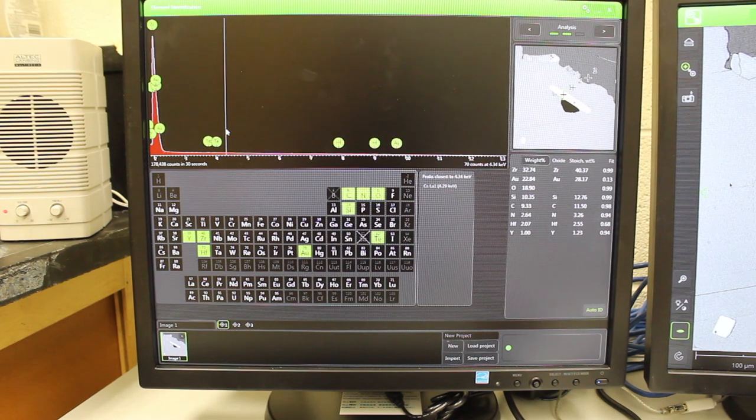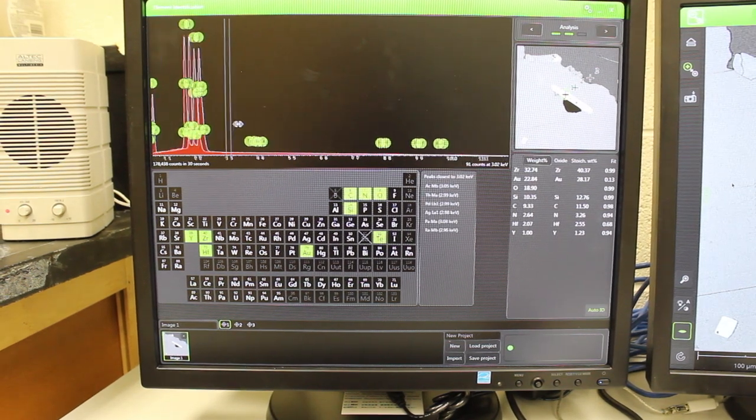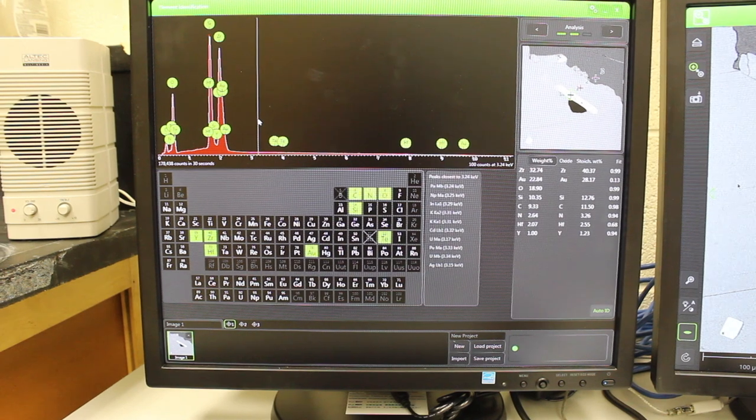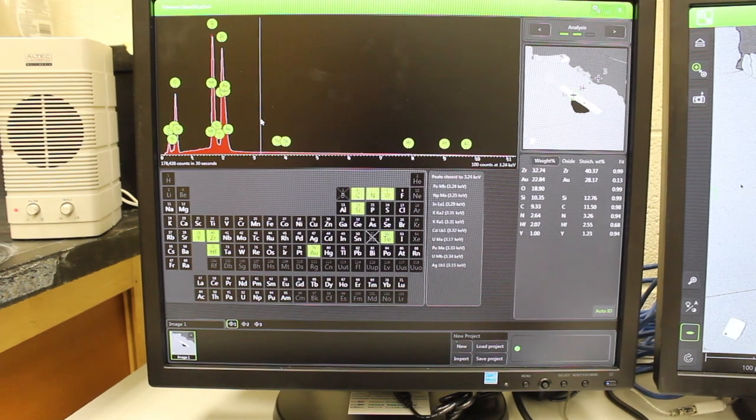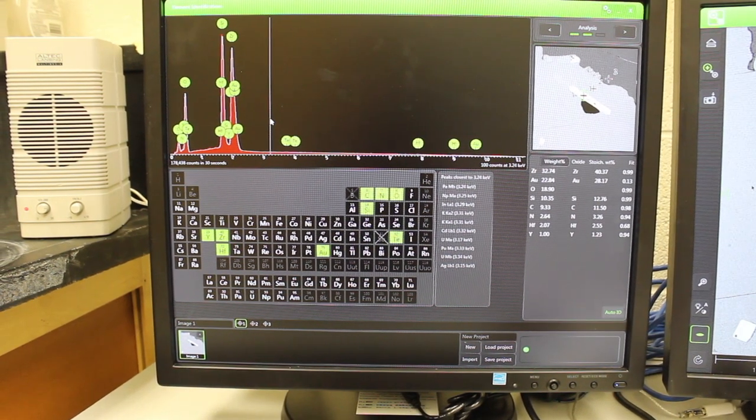That's too far in. I can use this line and kind of drag with the left side click and the mouse to expand and look at the spectrum.